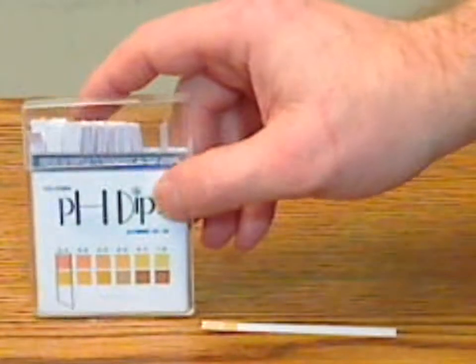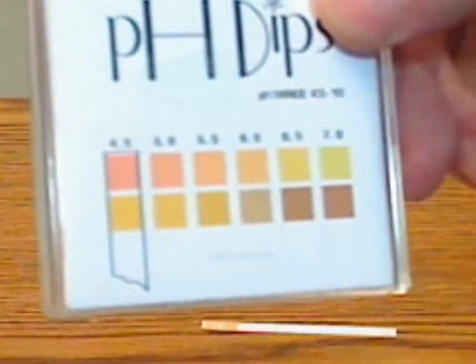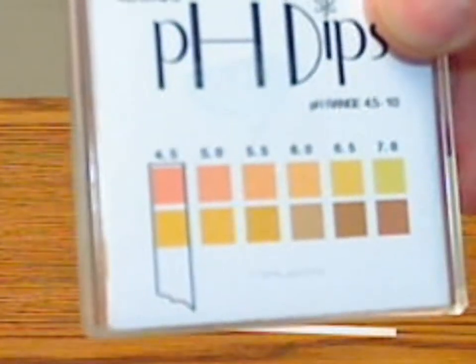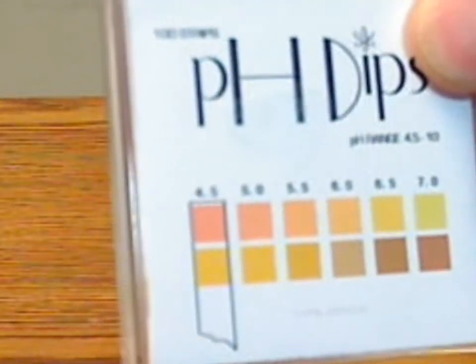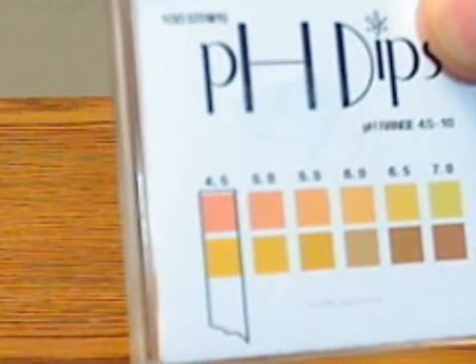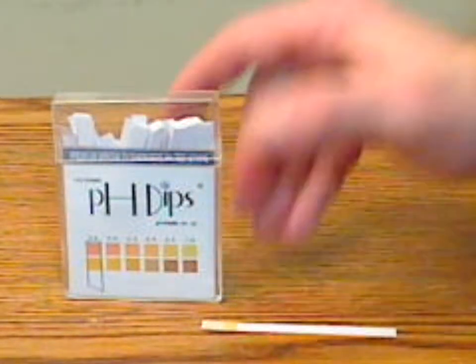These are a bit more specific than the Universal pH strip version. They go in half-increment steps, like 4.5 to 5, 5.5, and so on. And they go from a 4.5 to a 10 pH testing range — so a little bit more specific than the Universal ones.